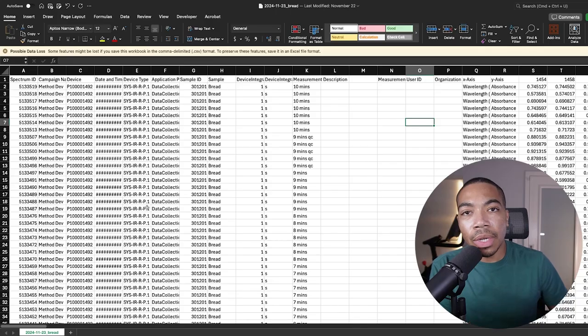But let's get started. Now, I want to begin with looking at the raw data. Oftentimes I jump right into the Python, but I think there's something to understanding where we're starting with the experiment. And so I want to walk through that first, and then we'll jump into our Python notebook. What I'm showing you now is the raw data that I've entered into Excel.